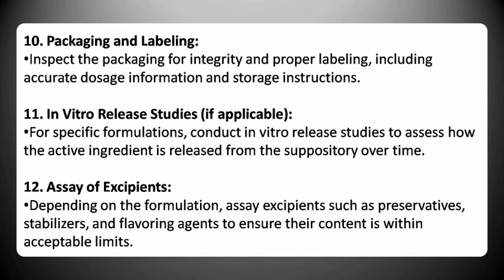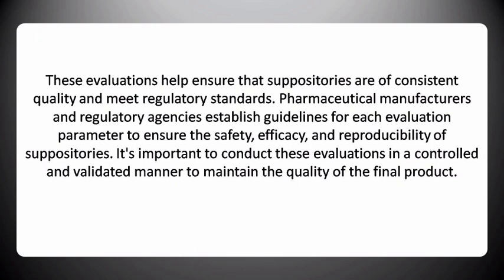Depending on the formulation, assay excipients such as preservatives, stabilizers, and flavoring agents to ensure their content is within acceptable limits. These evaluations help ensure that suppositories are of consistent quality and meet regulatory standards. Pharmaceutical manufacturers and regulatory agencies establish guidelines for each evaluation parameter to ensure the safety, efficacy, and reproducibility of suppositories. It's important to conduct these evaluations in a controlled and validated manner to maintain the quality of the final product.